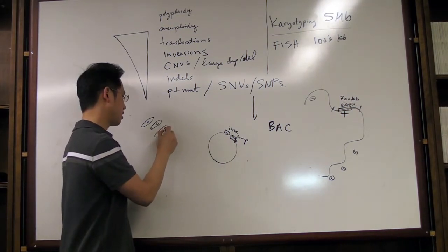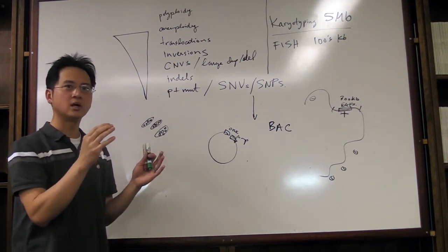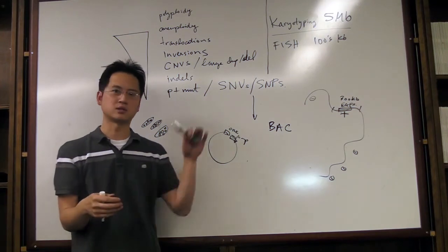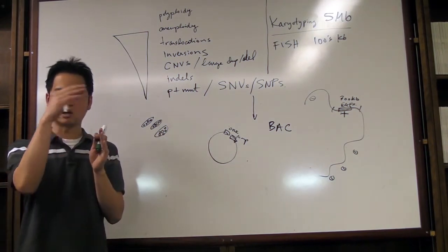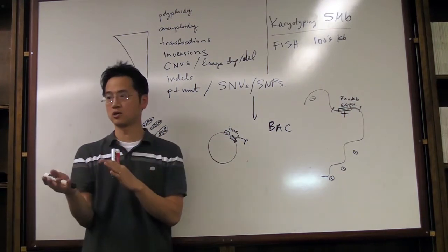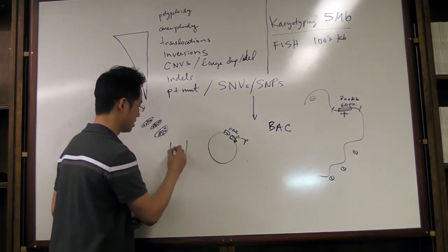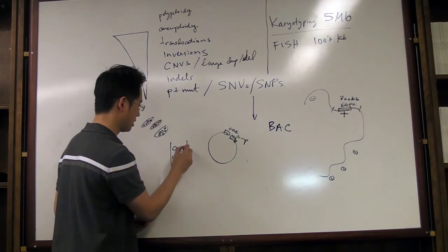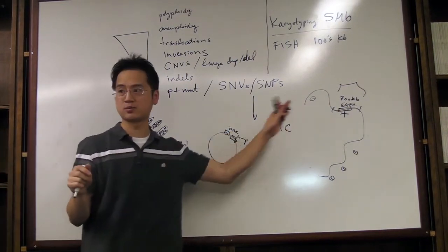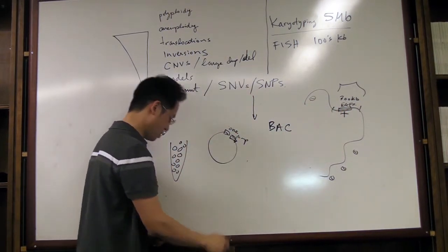These are probably not very high copy number, hundreds, tens of hundreds in each E. coli. So you burst them open, and then you do DNA extraction like I mentioned yesterday. Remember the sonication, or the mechanical, or the SDS. It's the same process. Here it's a little more challenging because these E. coli have a cell wall, which is tougher to get through. So you probably have to use not only SDS but also sodium hydroxide as another portion of the buffer. But in the end, you purify this through DNA extraction, and you basically have a tube of highly pure DNA which only contains this portion of the genome, but nothing else. This is where you get your specificity from: you're targeting just this region of the genome in this tube.